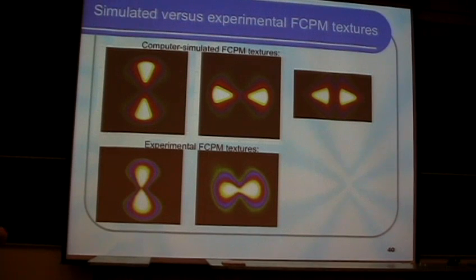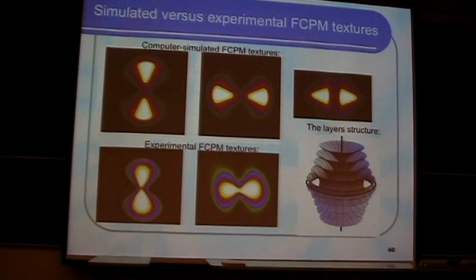Now, those computer simulated images can be compared to the respective experimental images obtained for the same vertical and horizontal orientations of the polarization direction. And based on images of this kind, both in-plane and vertical cross-sections, one can reconstruct complex patterns of molecular orientations or layered structures, like in the case of this particular smectic liquid crystal shown in here.